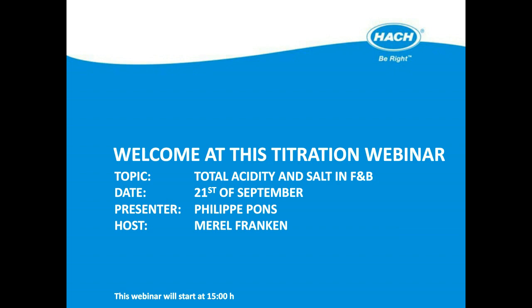Thanks, Merel, for this introduction. So, hello, ladies and gentlemen. During this presentation, we will focus on two major parameters commonly measured in food and beverage, which are total acidity and salt.